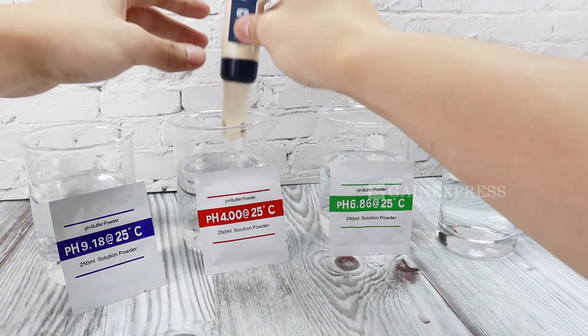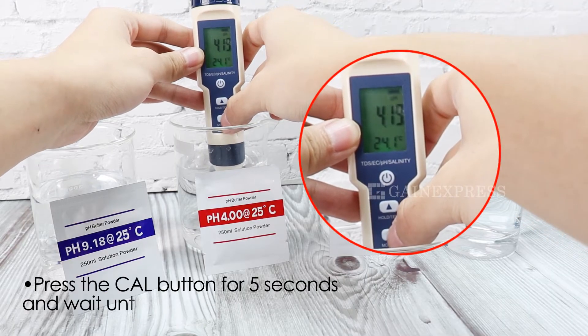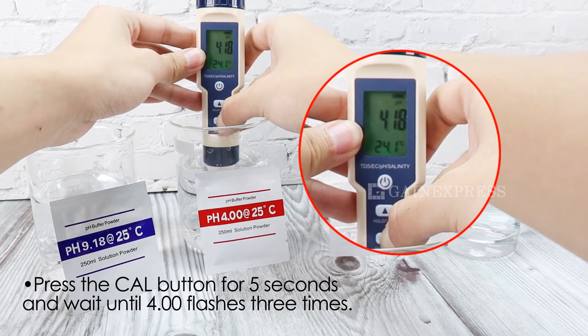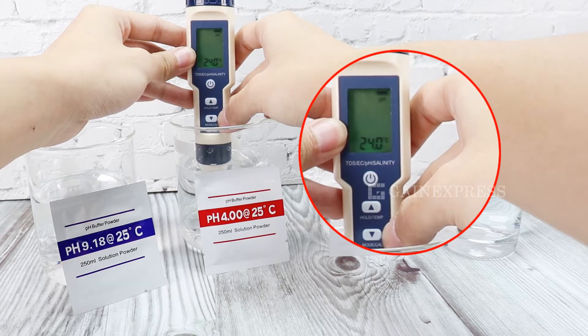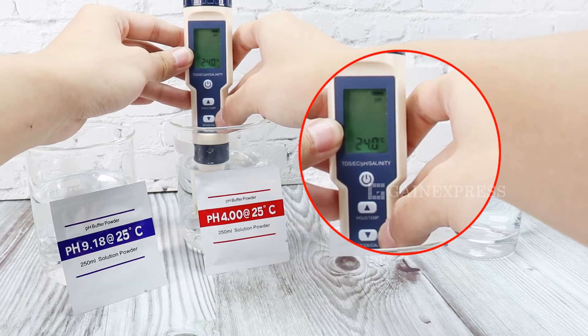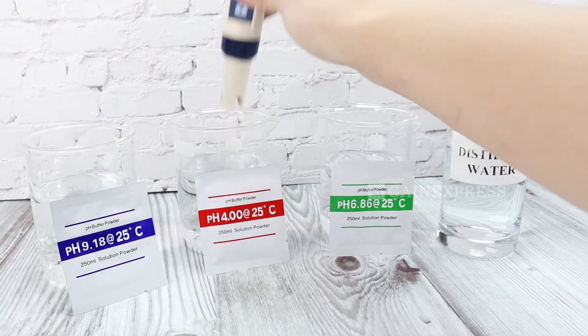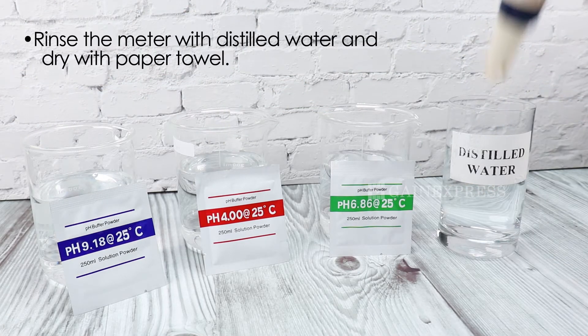Dip the electrode into the pH 4 solution. Wait until the value becomes stable. Press the CAL button for 5 seconds and wait until 4 flashes 3 times. Clean the electrode with distilled water and dry it again.